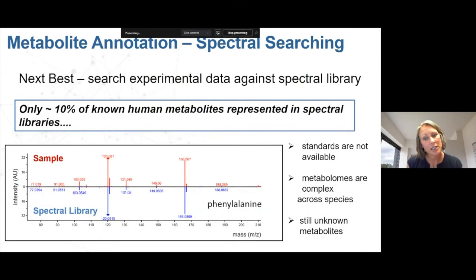So the next step is to... Jessica, can I interrupt for a quick question? Yes. We have several coming in, but one that's relevant here is a question about how peptides have specific fragmentation, and maybe a comment on small molecules and whether you can have diagnostic fragment ions that are universal across different metabolites, as you would see with peptides. Yes, I can comment on that. I will actually get to that in one slide. Oh, perfect. I will get to that in the next slide.